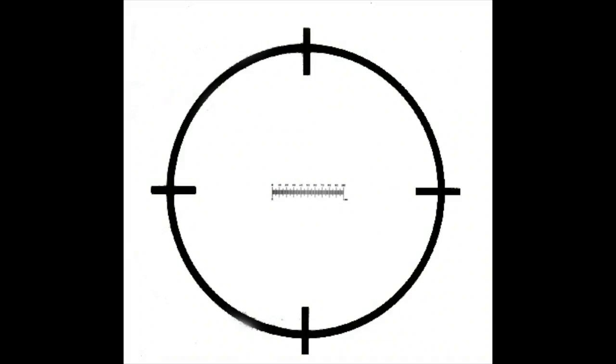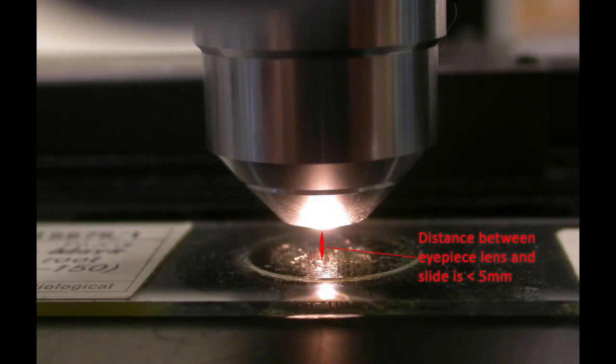Select your 10x objective and then look down the eyepieces, not before. For the 10x objective, the distance between the surface of the slide and the tip of the objective lens is less than 5mm as seen here.